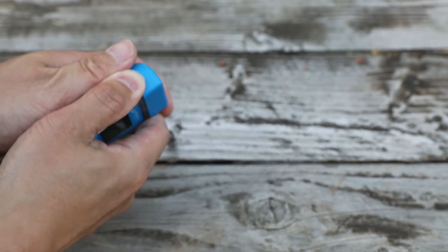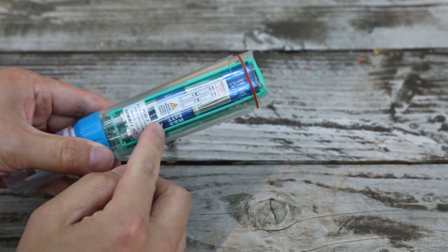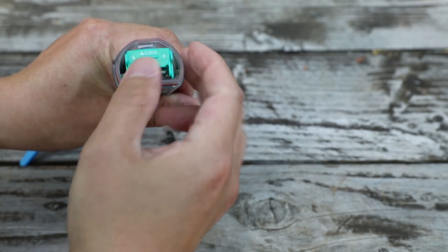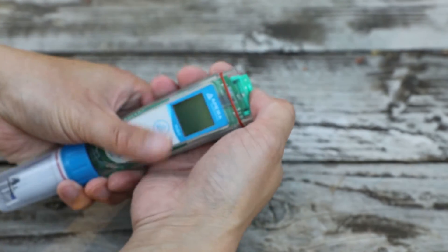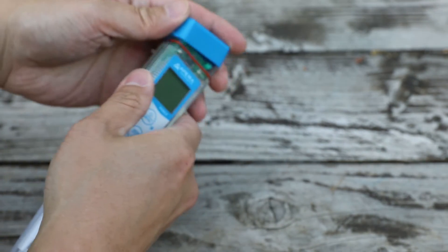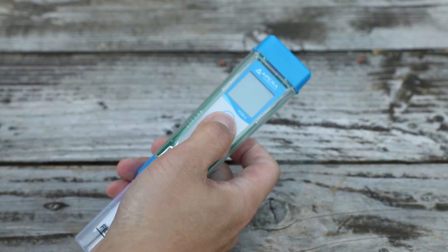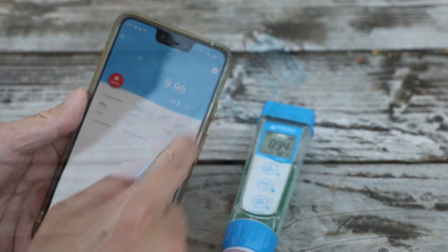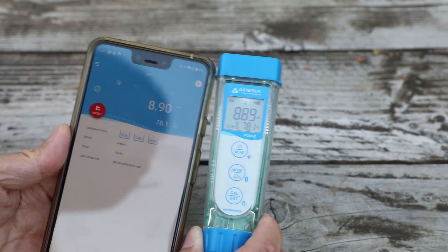At the top you can easily remove the battery compartment. The instrument uses four triple-A batteries. Pressing the top button will turn on the instrument. Once you turn on the app it will automatically pair; if not, you have to search and locate the instrument in the app manually.